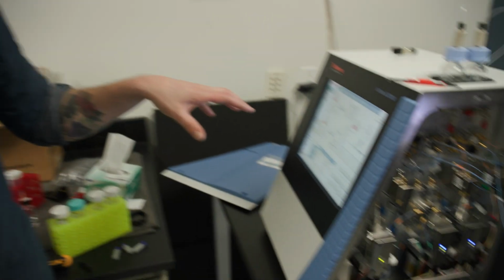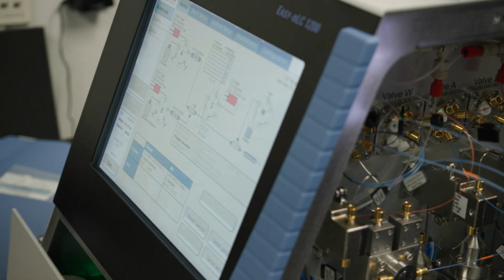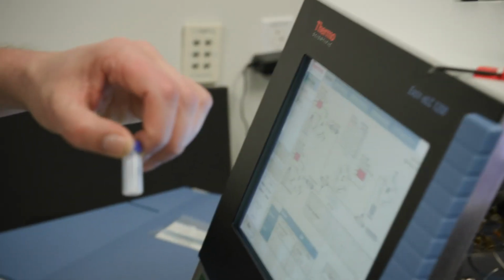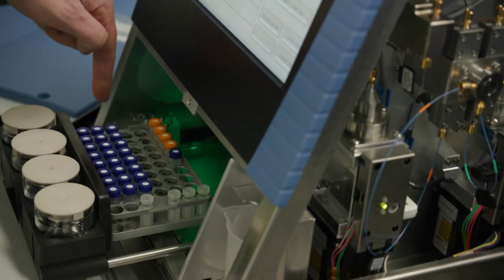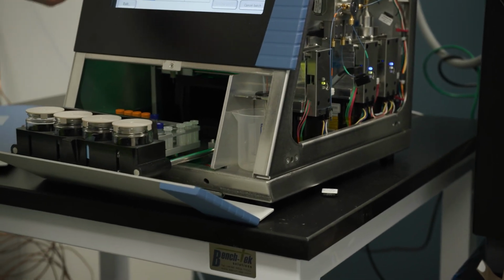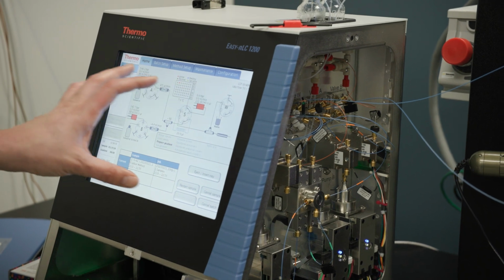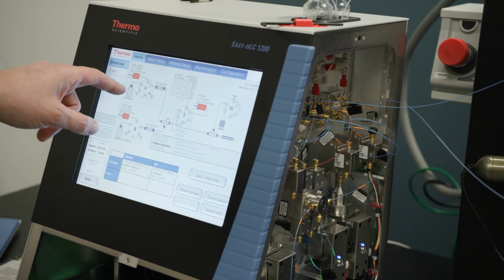Okay, so first what we'll do is we'll put our samples that we prepared in the wet lab in an autosampler here. And so what this autosampler does is we can basically prepare our samples and then put them in these particular HPLC vials, right? Which a needle under here will then dip in and pull up some sample volume. And then the sample volume will be injected into this liquid chromatography pump, so this nano liquid chromatography setup.